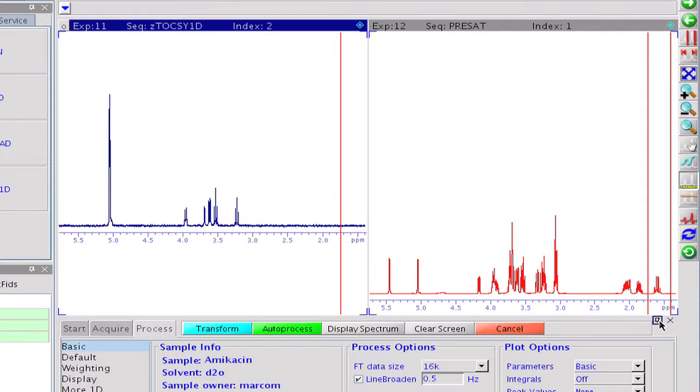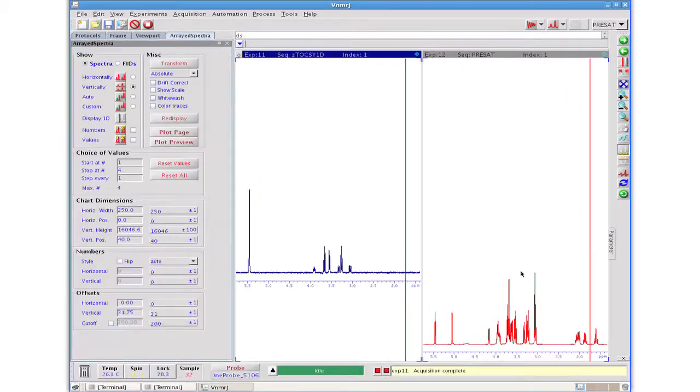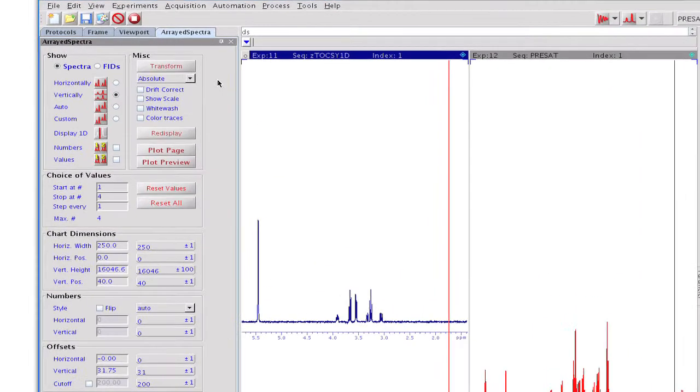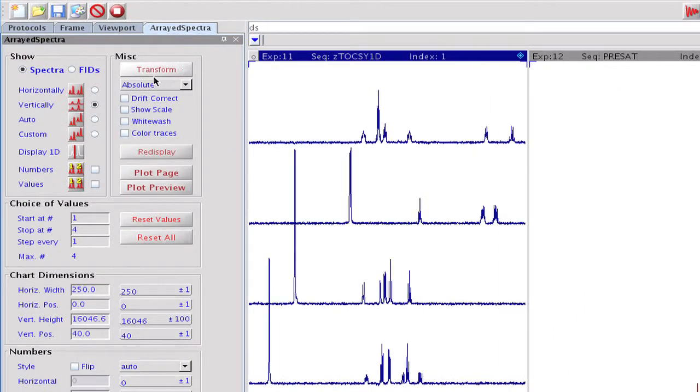We select an additional viewport with the pre-sat spectrum there. When all the data are collected, we make the final transform and overlay the spectra.